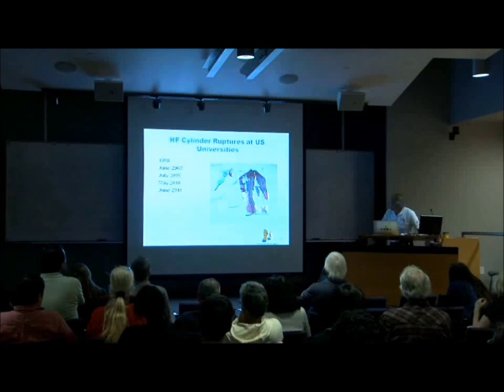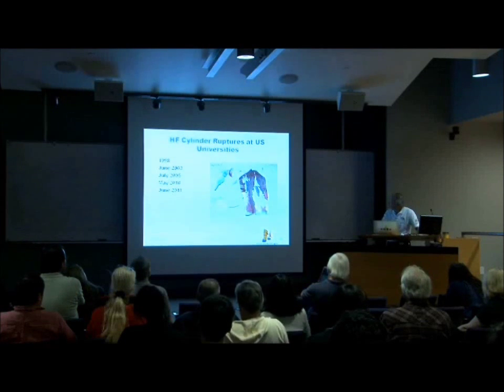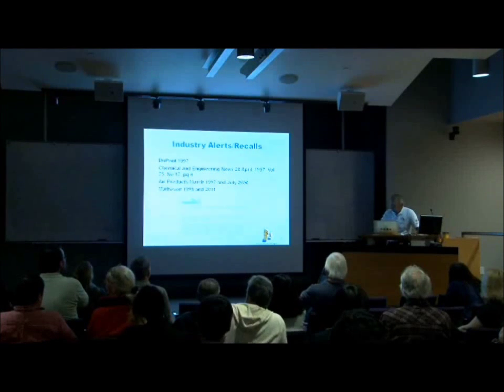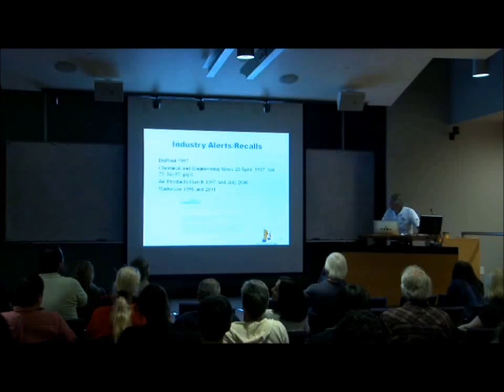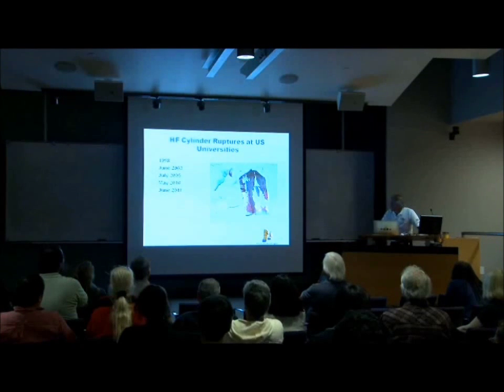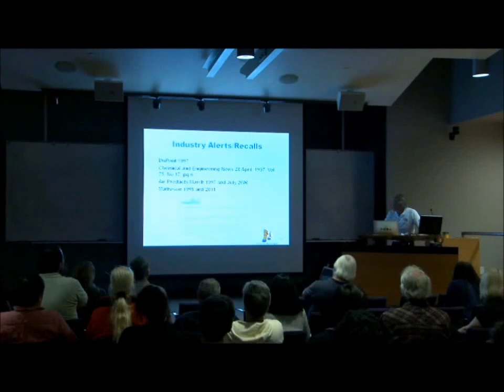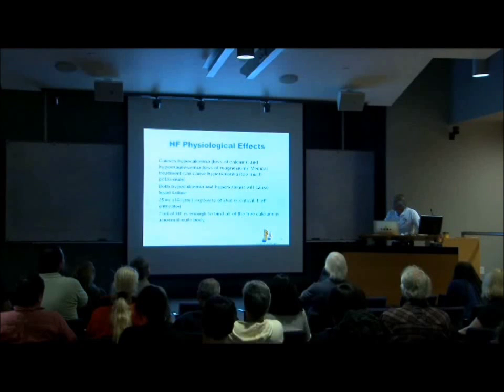Here is the statistic on explosions of HF cylinders at universities. That was at Santa Barbara. I didn't want to indicate that, but it wasn't UCSD. There was one in 2011 at a Big Ten campus that I took a look at as well. Many, many recalls. HF effect.